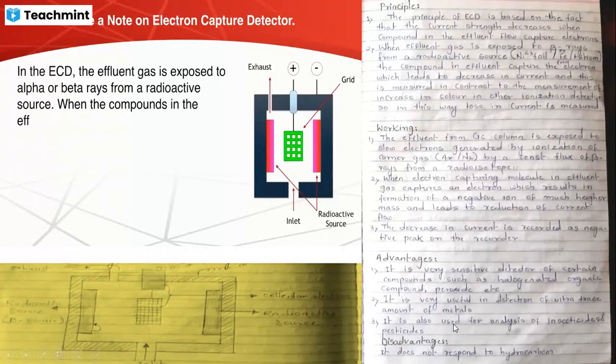Same thing was there in that particular video. It is a very simple detector. Okay, it does not respond to the hydrocarbons. It is a drawback of this particular ECD. Okay, right.